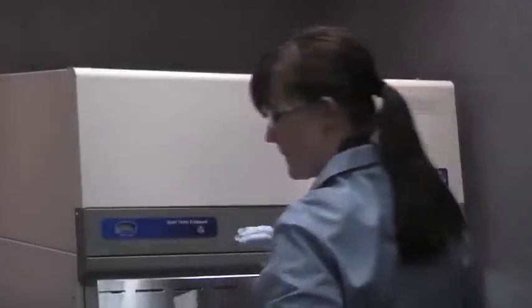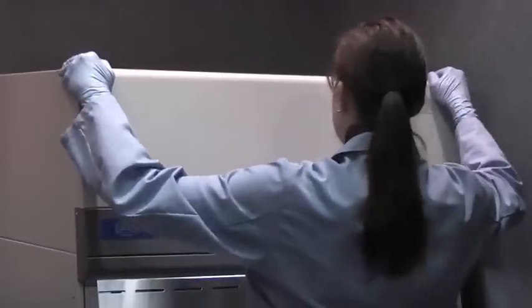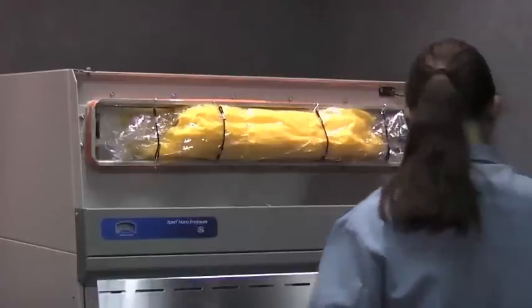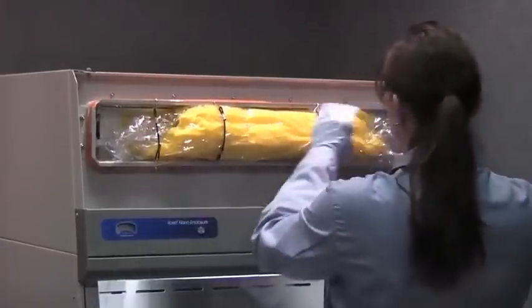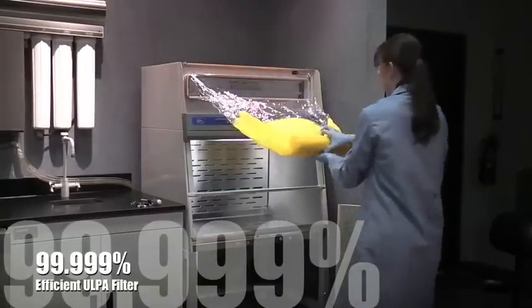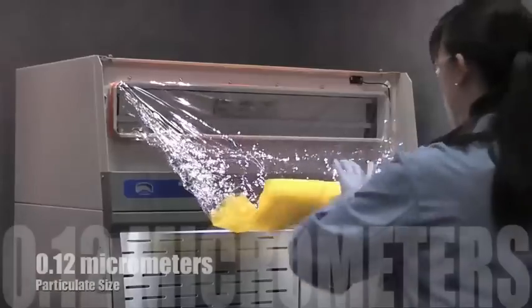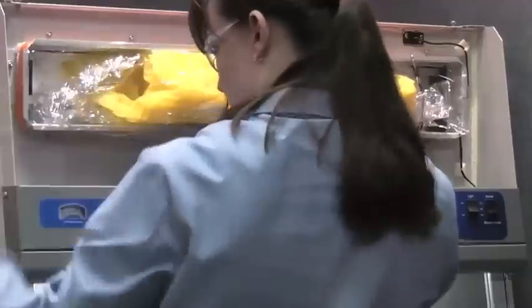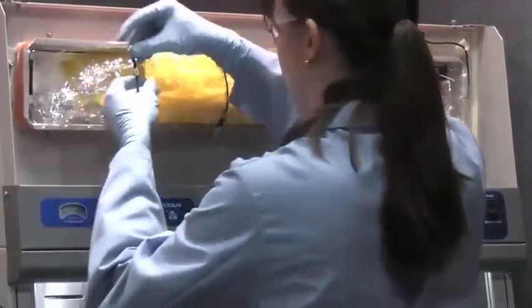The Expert Nano enclosure was designed with the concept of nano-sized particulate capture in mind. It features ultra-low particulate air, or ULPA, exhaust filtration with a true bag-in, bag-out filter disposal system. ULPA filtration provides 99.999% efficiency, which traps particulates 0.12 micrometers in size, so that ultra-clean air returns to the laboratory or clean room.